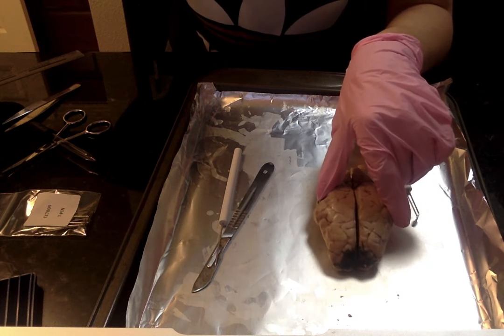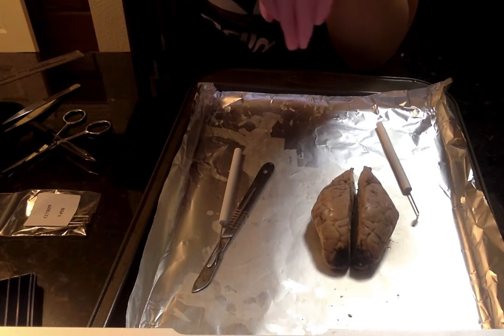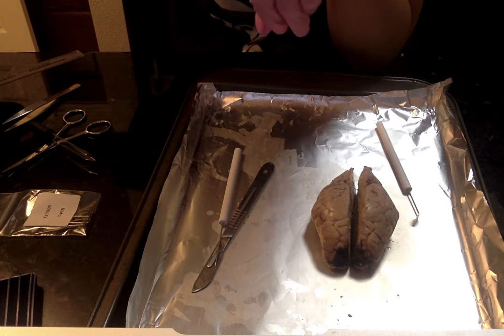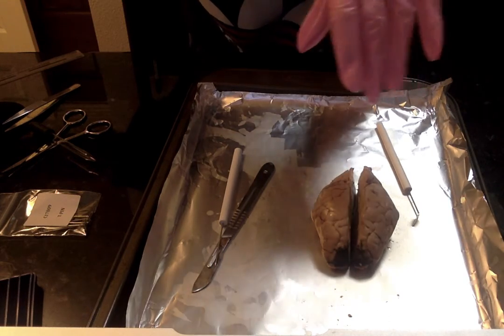So, the frontal lobes, like I said earlier, are more involved in motor function, problem solving, spontaneity, memory, language, initiation, judgment, impulse control, and social and sexual behavior.